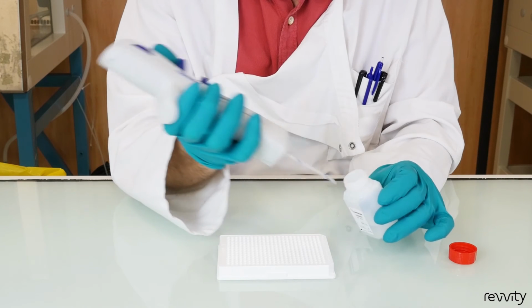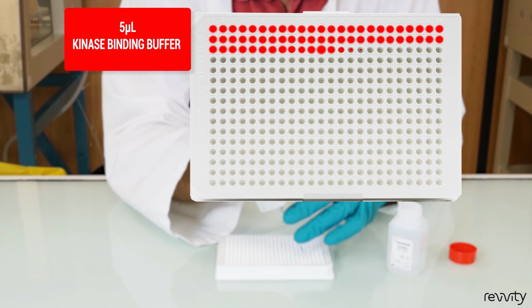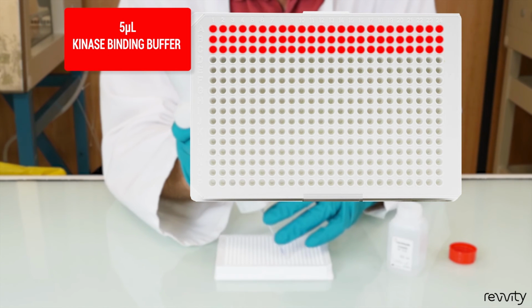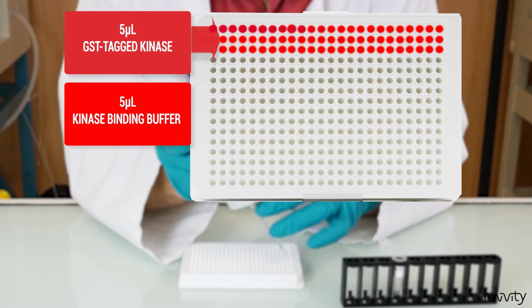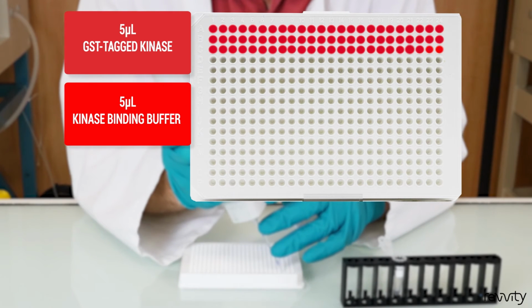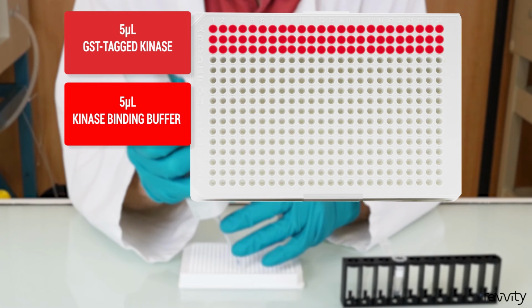Now it's time to start your assay. Dispense 5 microliters of kinase binding buffer into each well. For total binding measurement, dispense 5 microliters of your GST tagged kinase to each well. You may substitute this with kinase binding buffer for non-specific binding measurement.